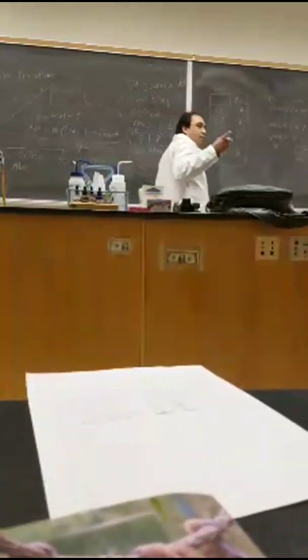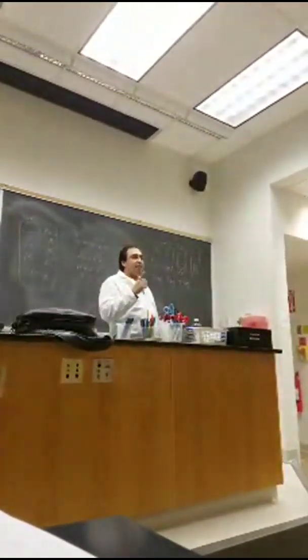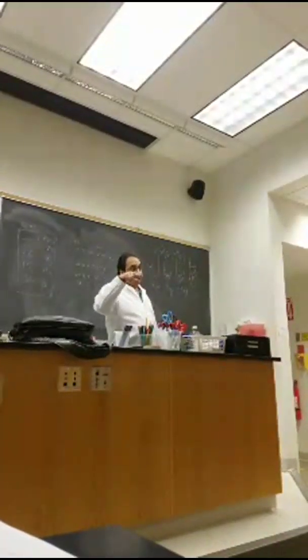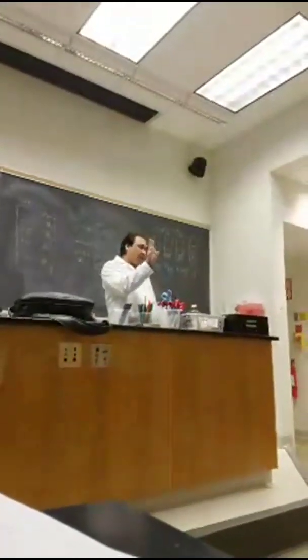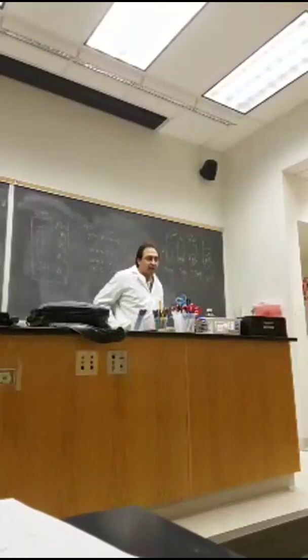First thing is that for each and every sample, you need to find out the wavelength, because wavelength is different for each and every sample. You did dilutions there and measured the wavelengths, but that wavelength is very nearby. I think that is the common result.